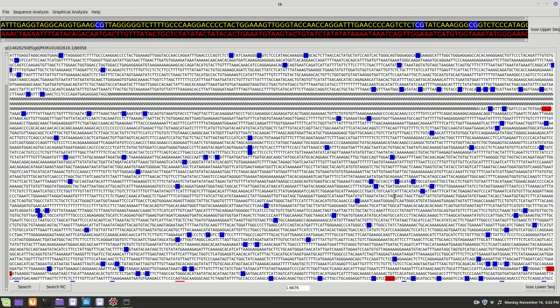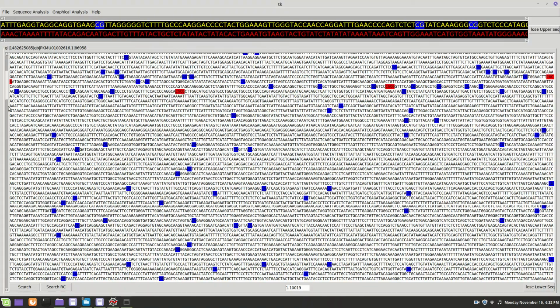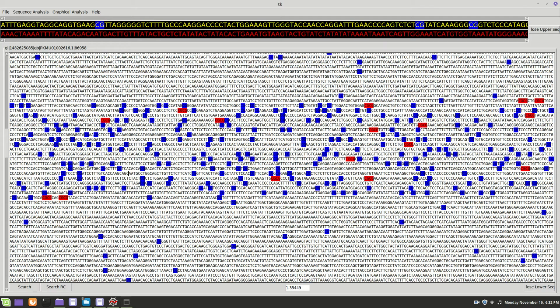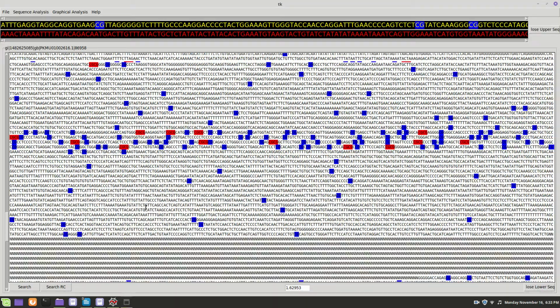And so I'm going to close the frame. And we should be able to find our CpG islands here. Now I scroll down and, oh, there's one right here. Okay, scroll down. Definitely one, very large one here. Let's scroll up, this thing flickers too much. All right, but a very large one. I would have suspected maybe this is 2 genes, but they're just too close together. It's just got a very large regulatory region here. So we scroll down, and here's another one. See, this is very easy. These are the last 2.